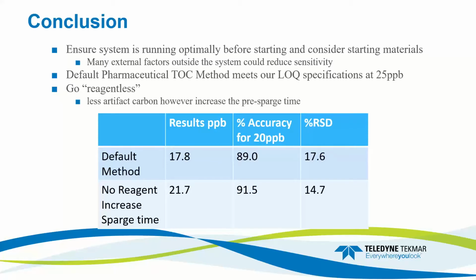And then optimizing our methodology is going to allow us to achieve the best results possible by doing extra rinses, by increasing our rinse volume to ensure that we're rinsing with the same amount, if not more, than what sample we're putting through to help clean up that pathway. And as you can see here, we have really good analytical results at the low level.